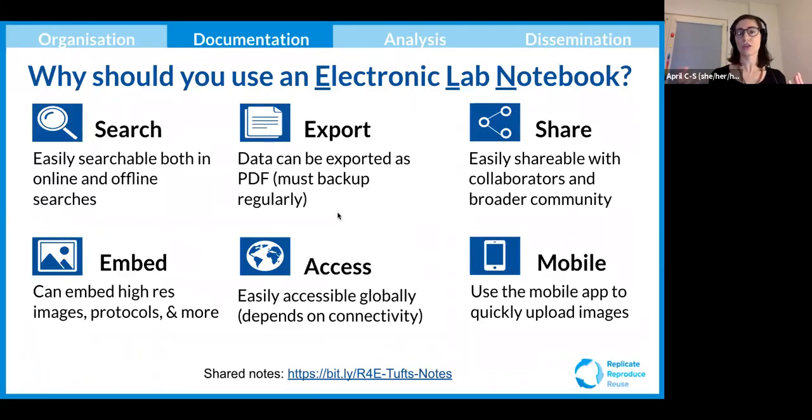So some ways to think through whether or not an electronic lab notebook might work for you is to think about whether or not you will benefit from searching through your notes more easily, whether being able to embed the work that you're doing in other platforms, such as websites or emails or other collaborative tools, would benefit the work you do, whether exporting can help you to back up your work, because it can definitely help you to keep some redundant places to save the important work that you're doing, and whether it's possible to control the access that people have to your work.